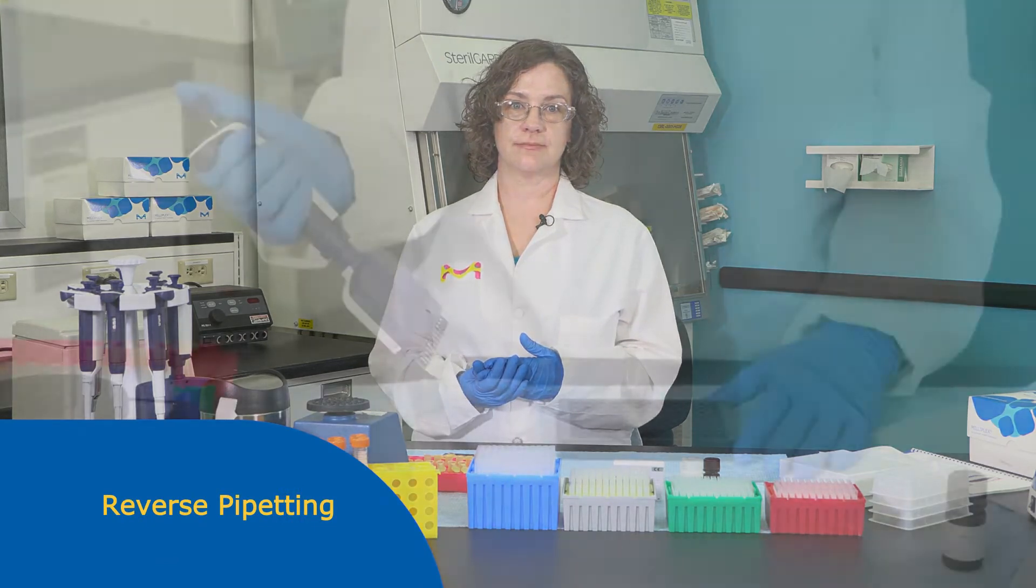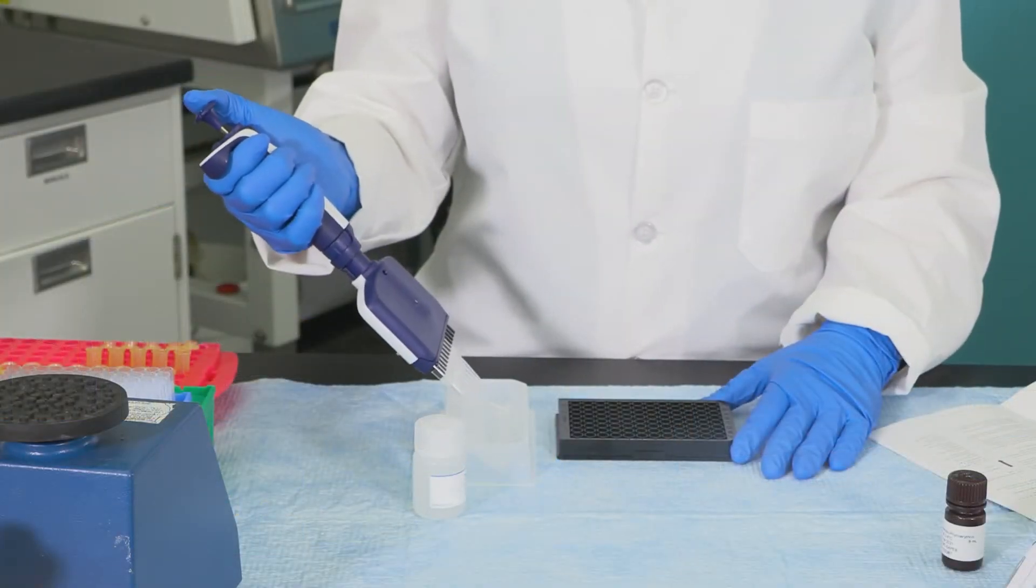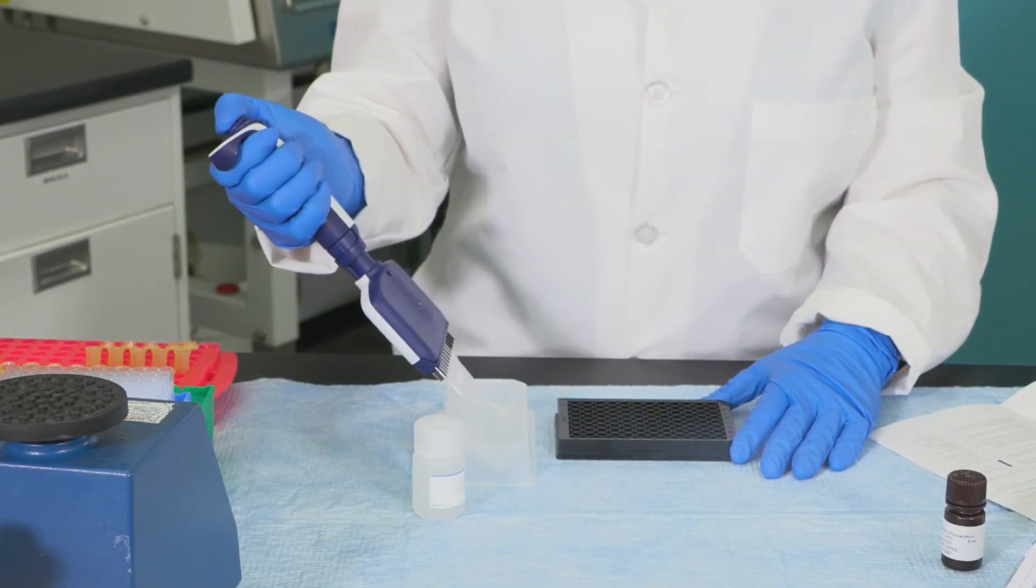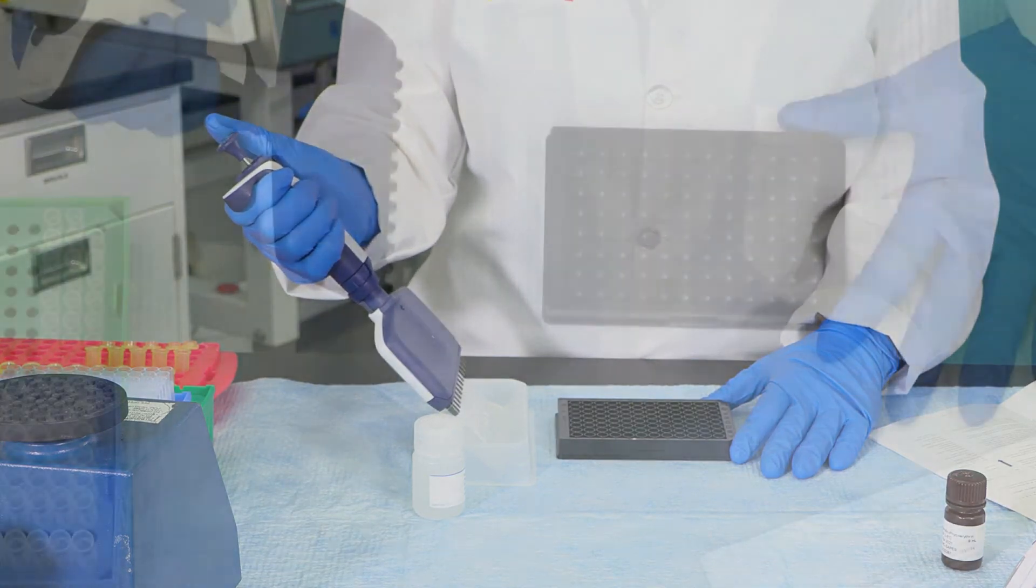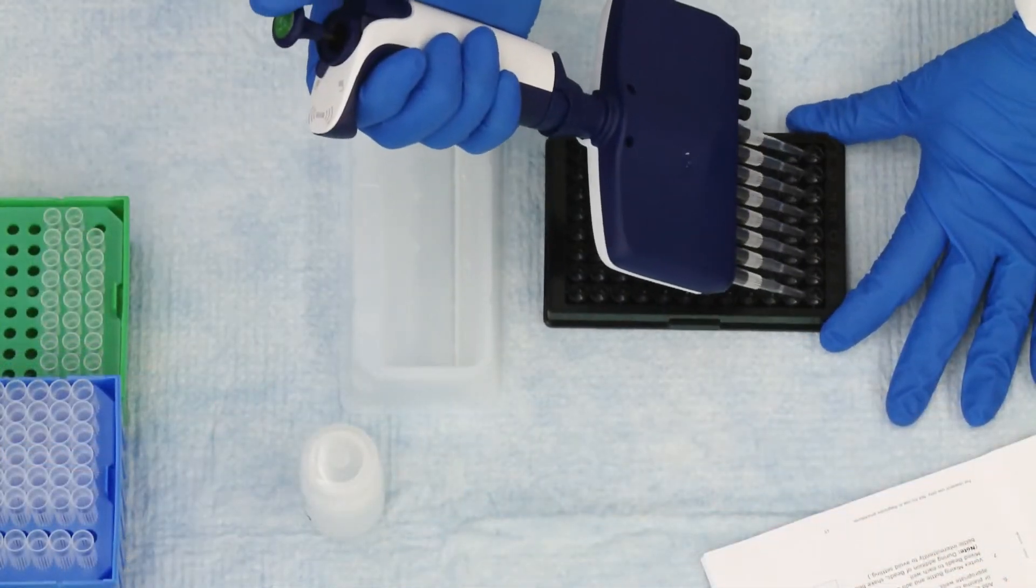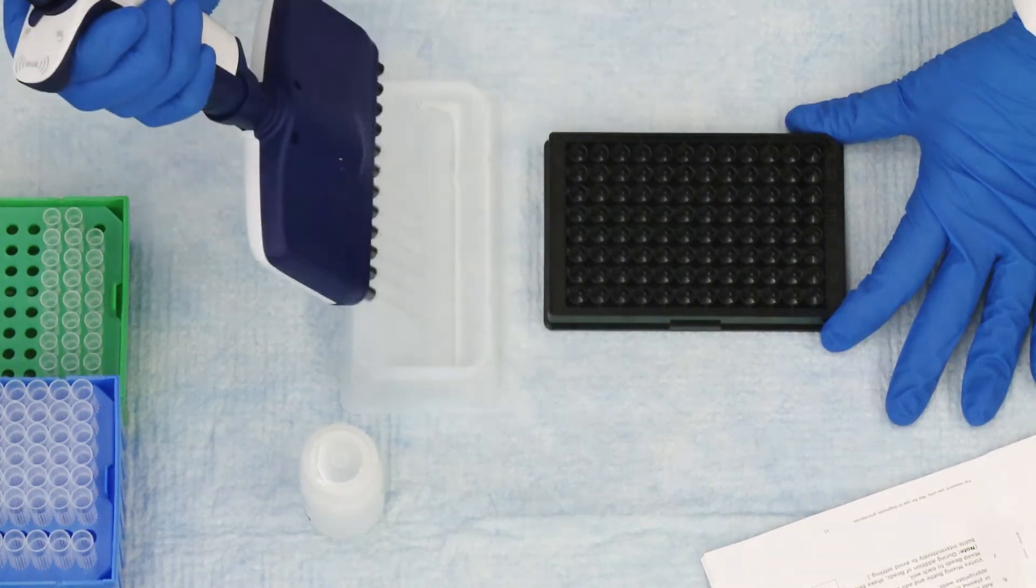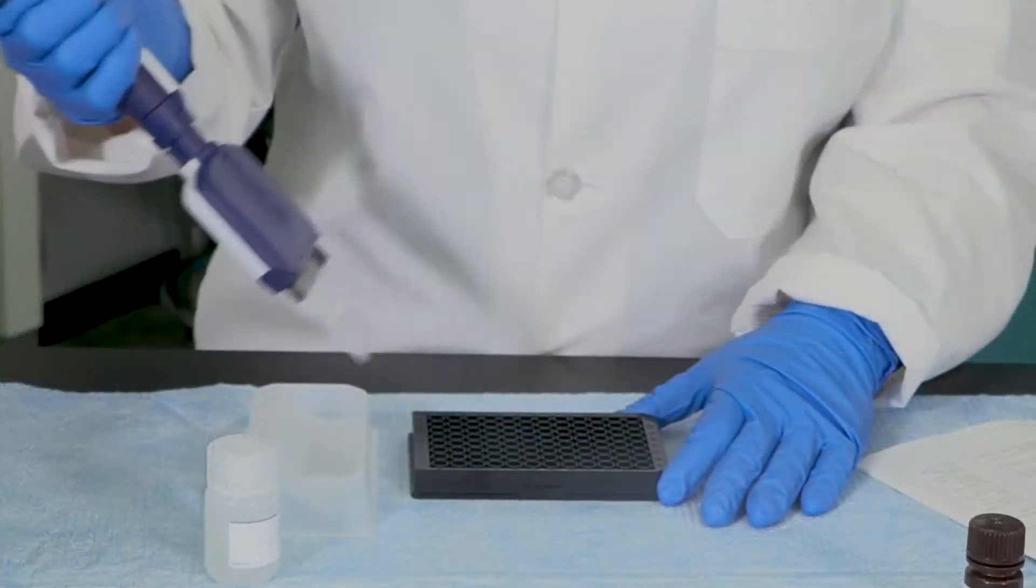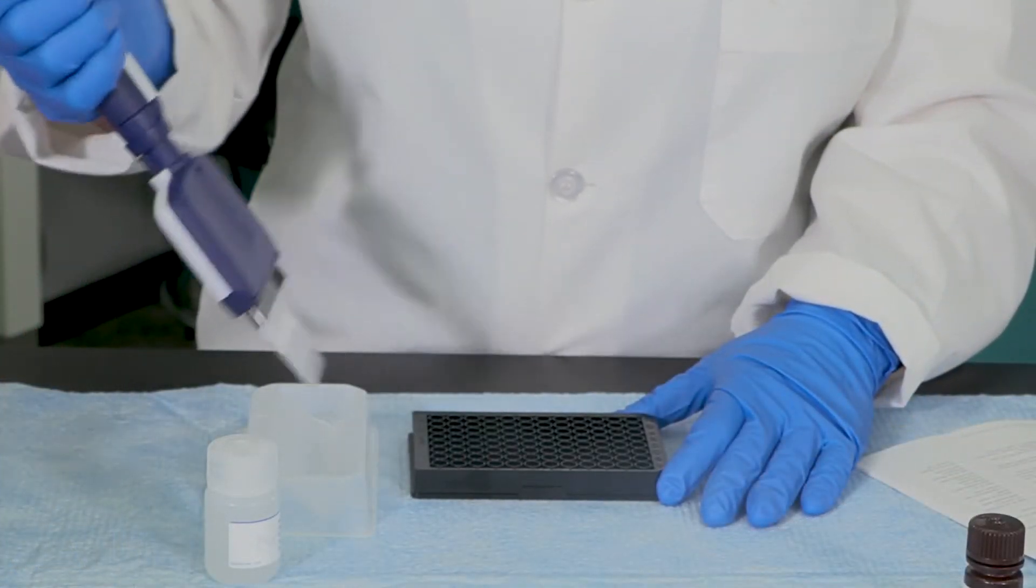Use reverse pipetting for more accurate dispensing. Begin by depressing the plunger past stop one and aspirate the liquid. To dispense the liquid, touch the tip against the well wall and push the plunger only to the first stop to dispense the intended volume.